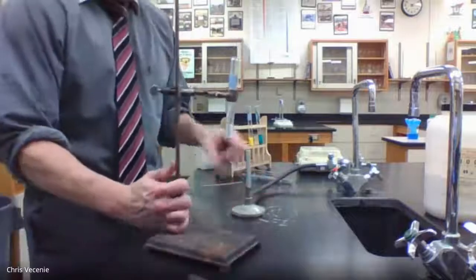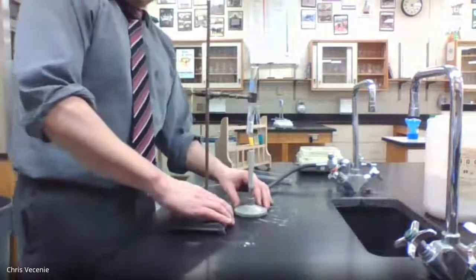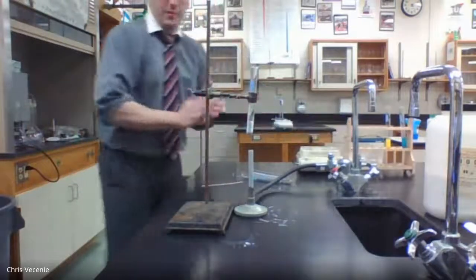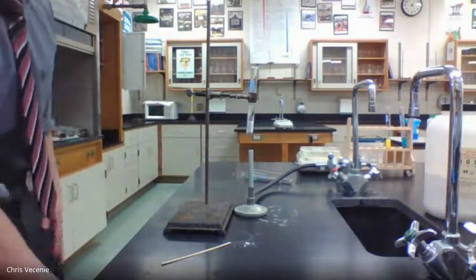I'll set this back just a little so you can see what's going on. I'll take some things out of the back so you have a better look. All right, I'm going to light my burner and heat this for 5 minutes.